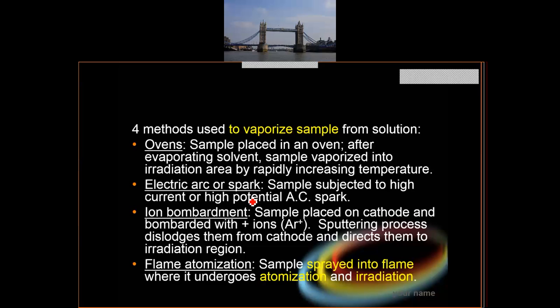Okay, what we need to remember, there are four types of vaporizing technique: flame, ion bombardment, electric arc, and oven. What about the other three? You can read about them, but the one that we are using is this one.